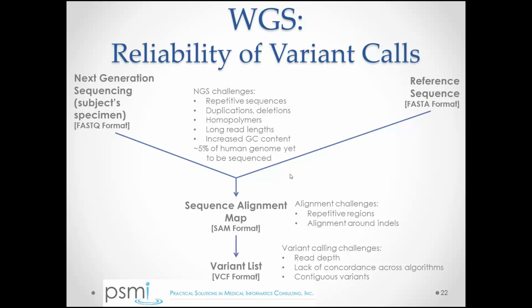It depends on the correction algorithms. And so it's very difficult to give an overall accuracy. For the most part, a lot of companies claim their overall accuracy for a call at an exon of interest might exceed 99.999%, whereas across the board it might be smaller.